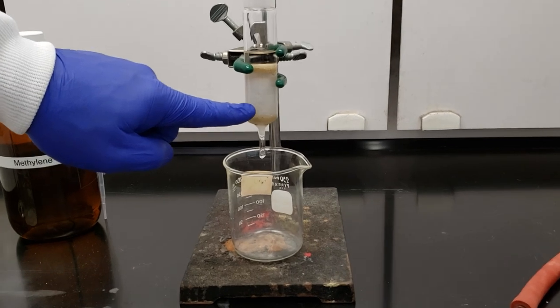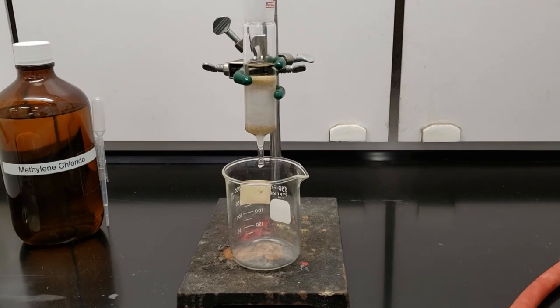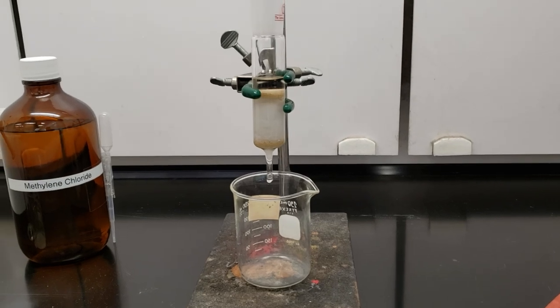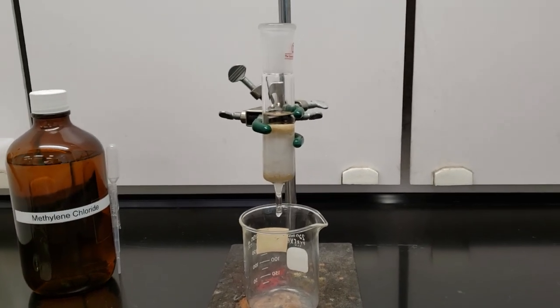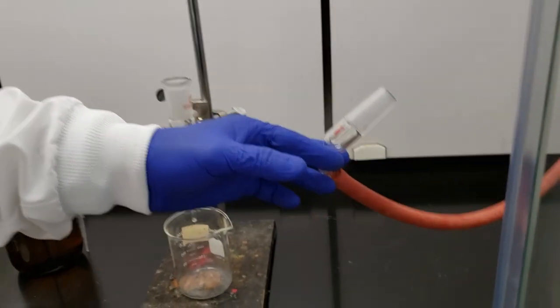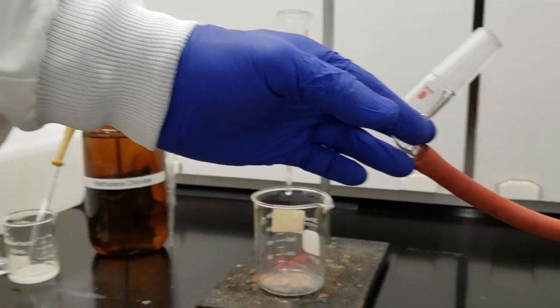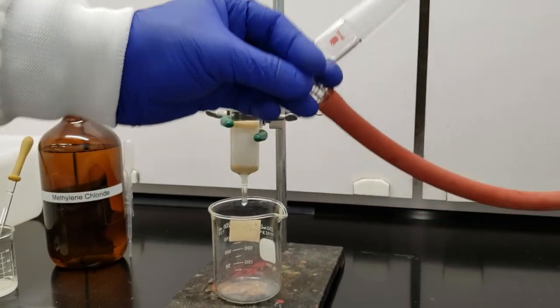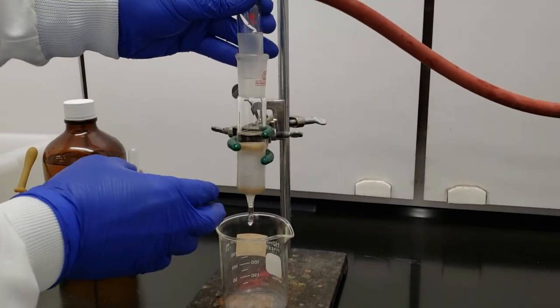We see a couple of areas where the column is not packed tightly. We want to push those down and compact them so that we've got a nice uniform layer of silica for our product to drain through. So I'm going to go ahead and use this air hose. Turn it on at a gentle setting. It doesn't have to be a lot. And we'll put this into the top of our column.